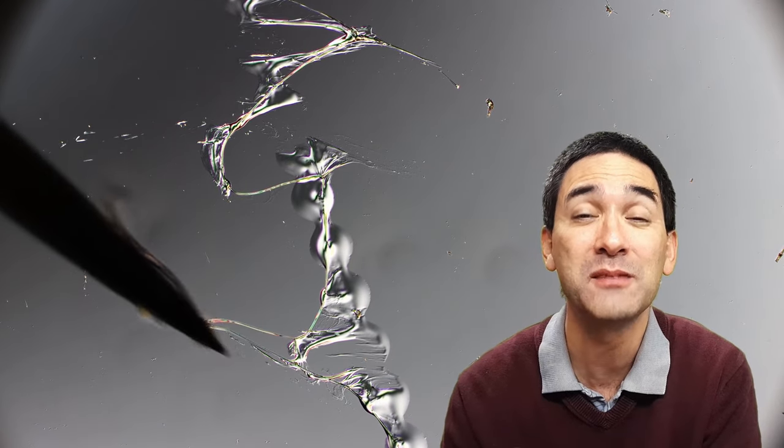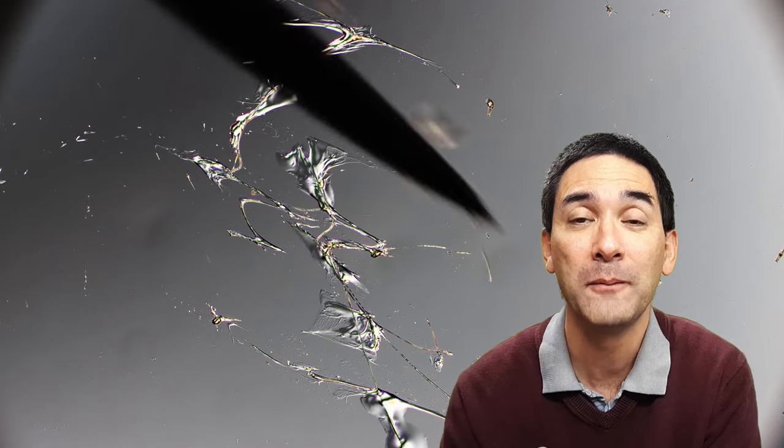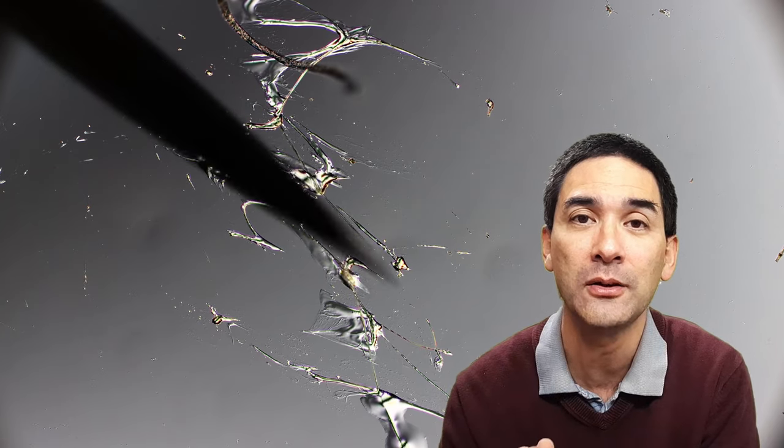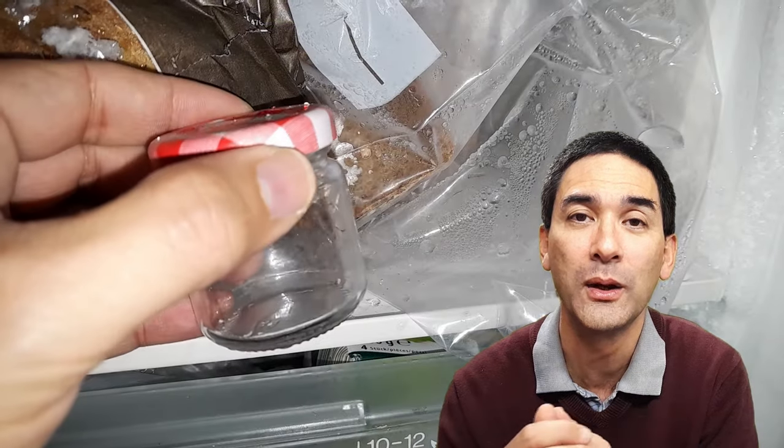As a matter of fact, the spider silk is made of a protein and the glue is made of a glycoprotein so there's also some polysaccharide in there, but as you can see very effective and it really likes to stick well to the slide.